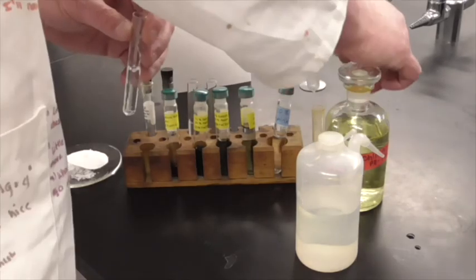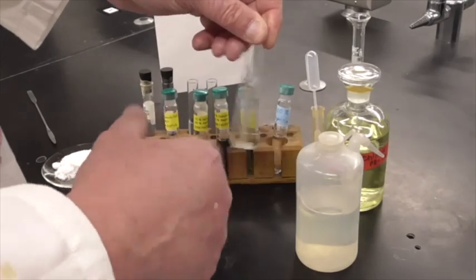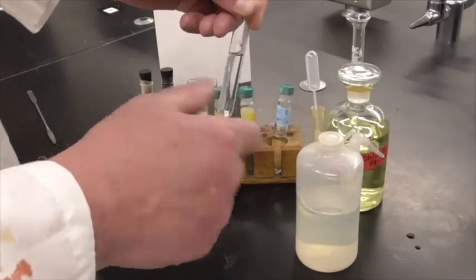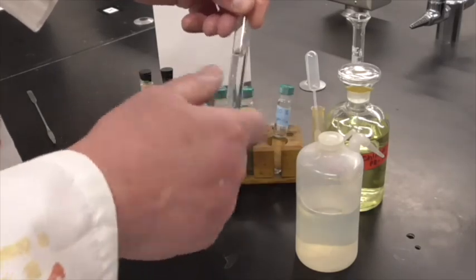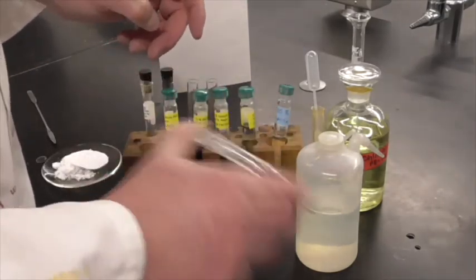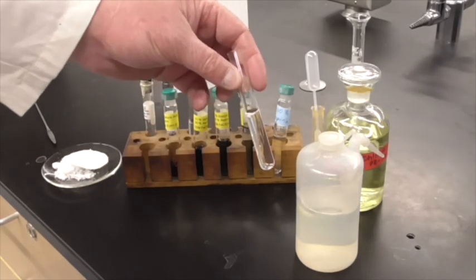So basically what we're testing for is if there's any salicylic acid left over. Did it all convert, or did we wash it all out, or is there still some mixed in there? Now remember, salicylic acid was the one that caused serious stomach problems. So we clearly don't want any of that in there. That's the reason we did this reaction to convert it to aspirin. So I'm just shaking it up a little bit here. And it doesn't have to all dissolve. Salicylic acid isn't all that soluble in water. All right.